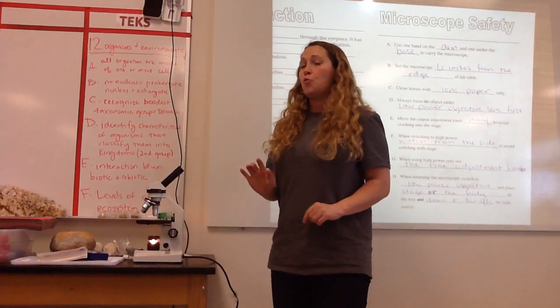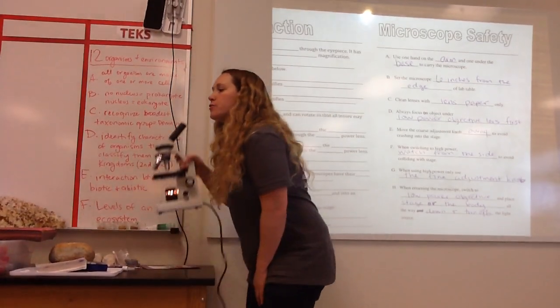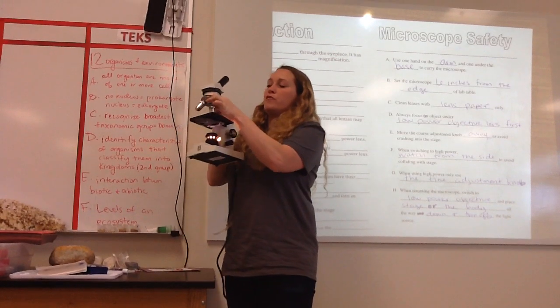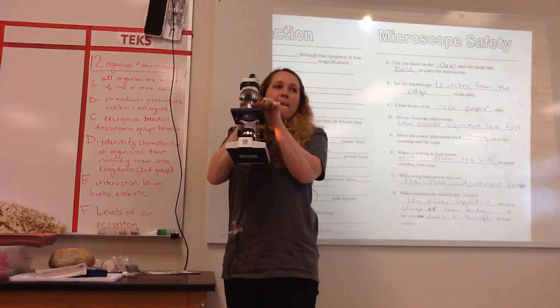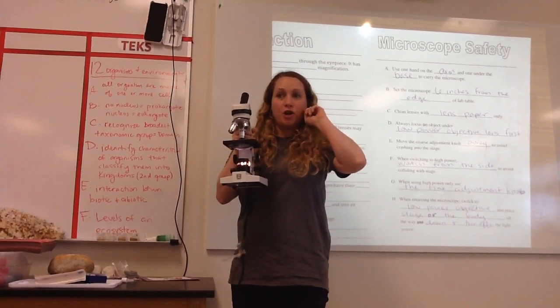Now I need to make sure I'm on low power. Low power is the short one. So you take the nose piece. I like to pretend the microscope's a face. The nose piece is right where your nose would be. Okay? So the nose piece swivels. Do you see that? When you swivel it, you need to make sure you hear that little click. Did y'all hear that click?